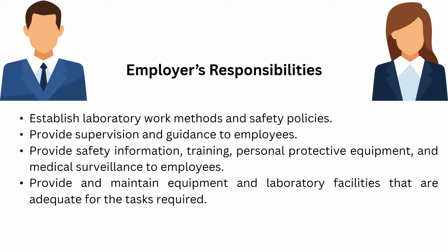The employer and the employee share safety responsibilities. So, not just the employees, the employer also has responsibilities to comply. The employer's responsibilities include establishing laboratory work methods and safety policies. They provide supervision and guidance to employees. They also provide safety information, training, PPE, and medical surveillance to their employees. And to provide and maintain equipment and laboratory facilities that are free of recognized hazards and adequate for the tasks required.